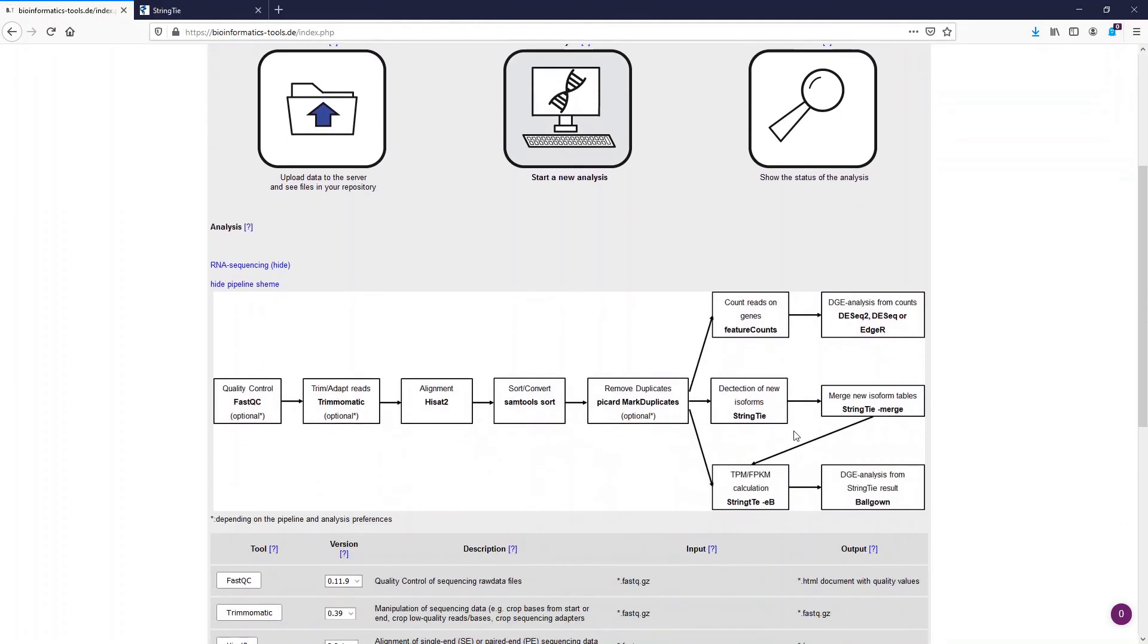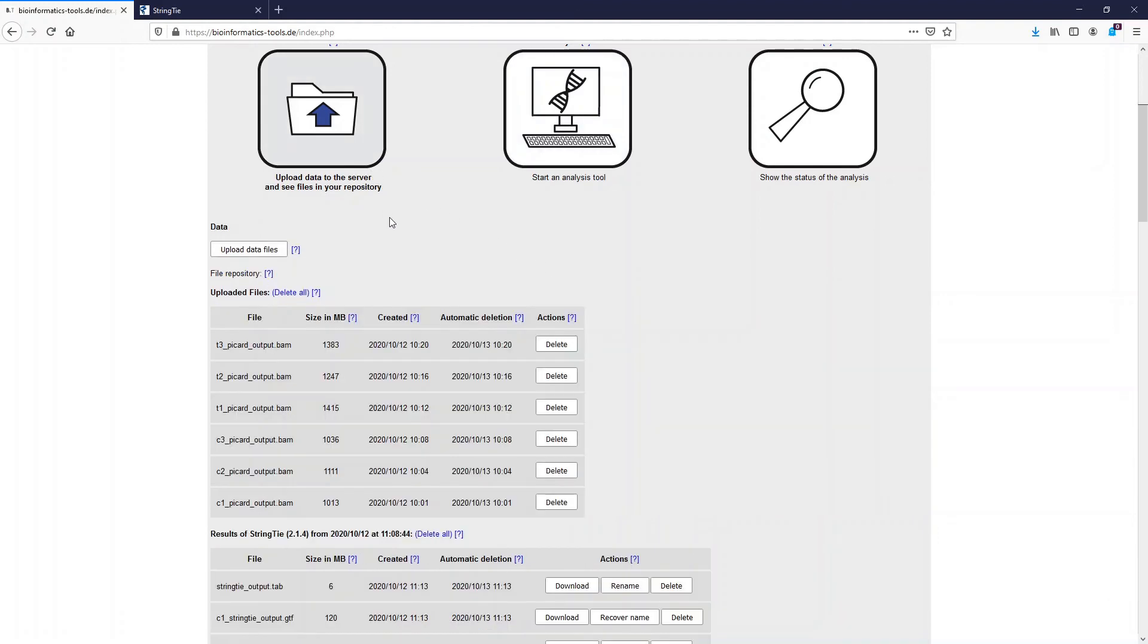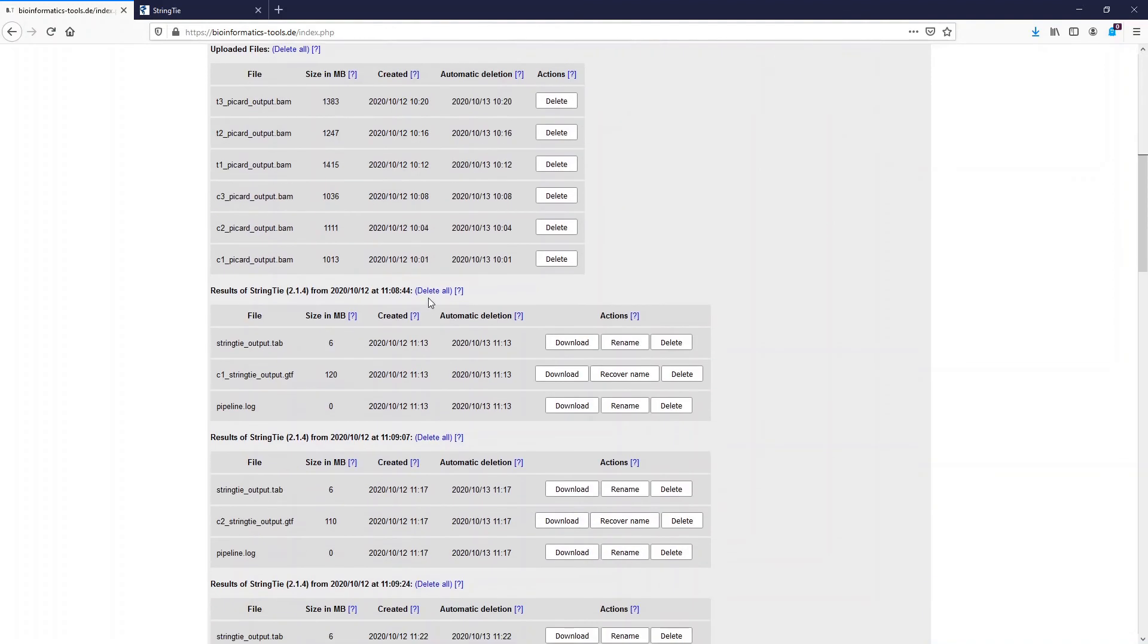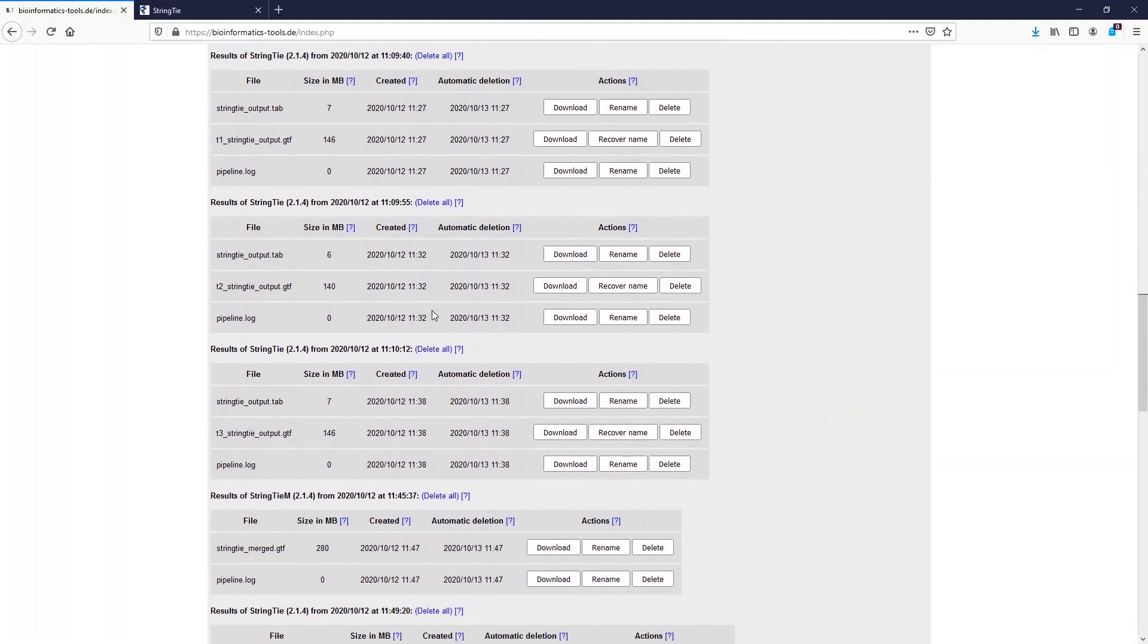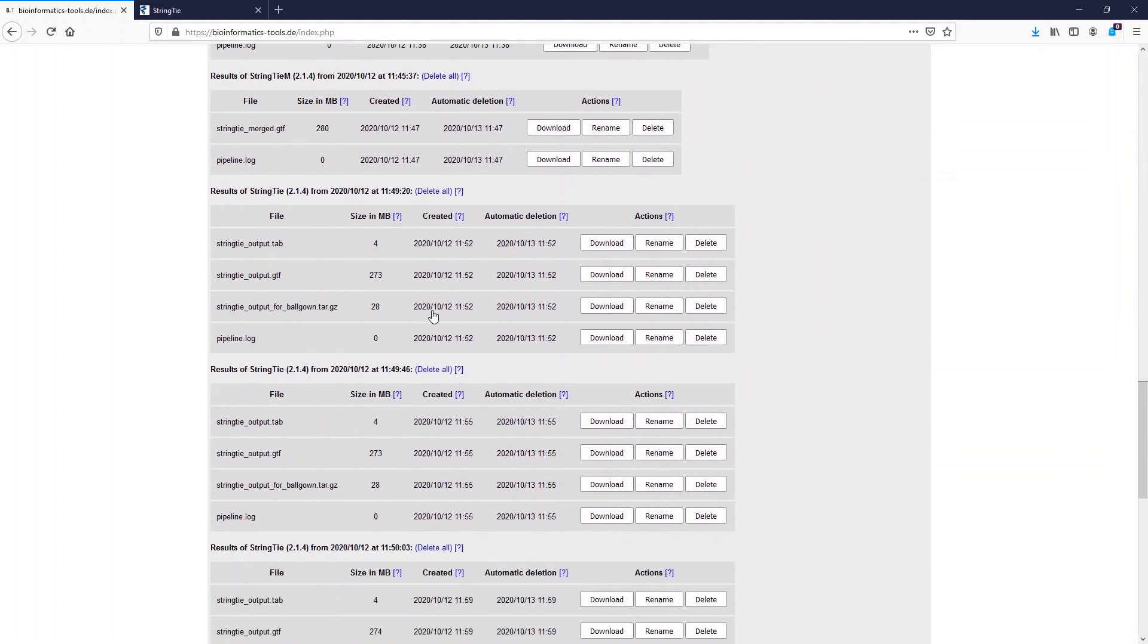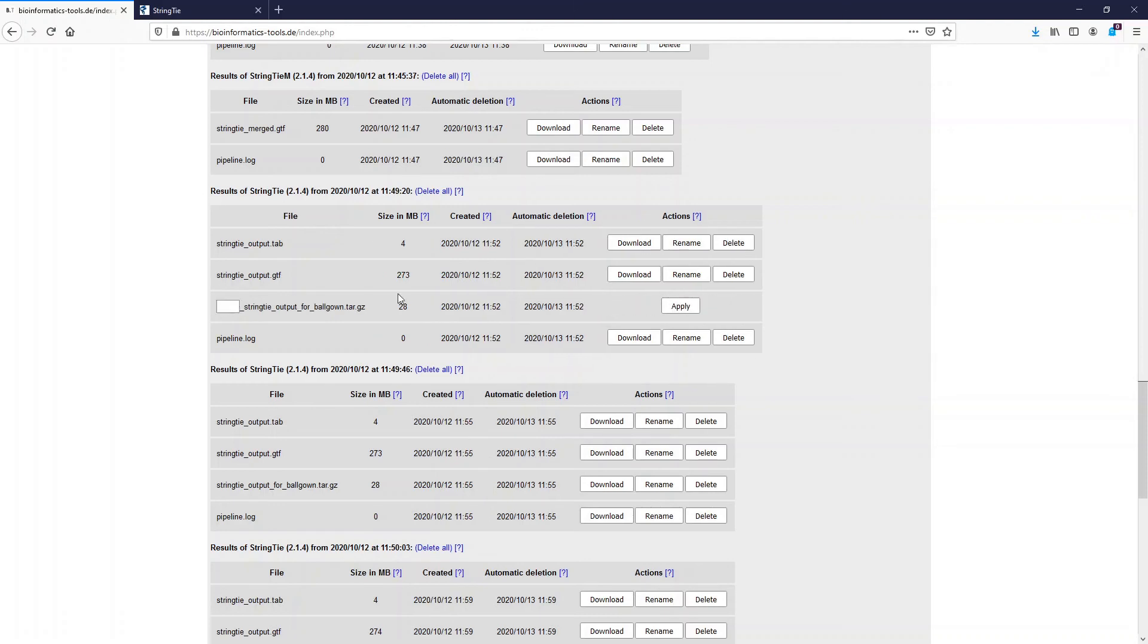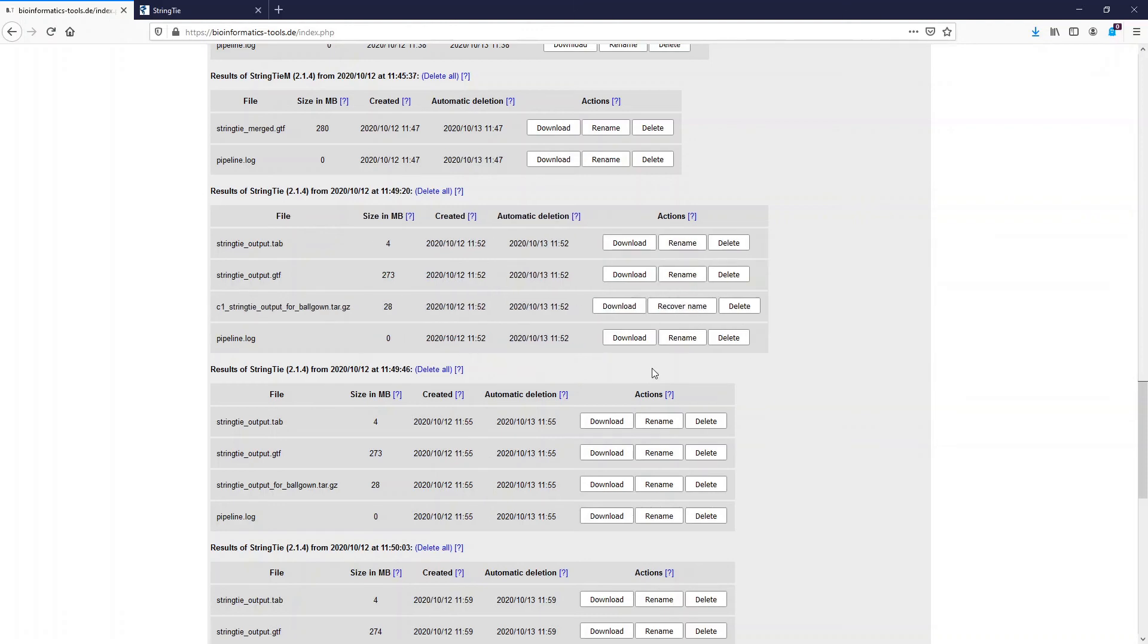Okay now we did this part here and now we can calculate with the results file the differential gene expression. However before we start we have to rename all the files because as I said earlier the output file names are always identical and depend only on the program which was used.